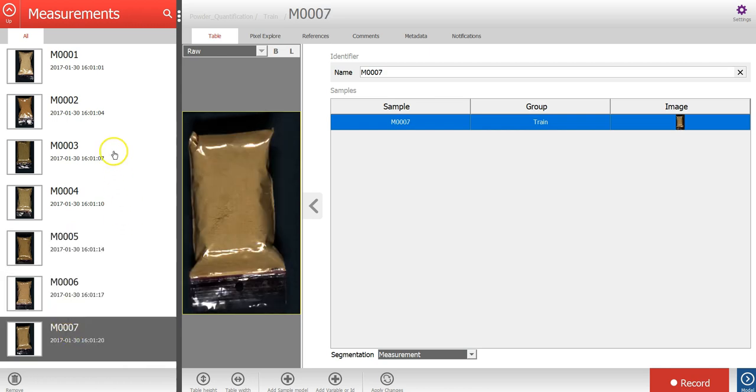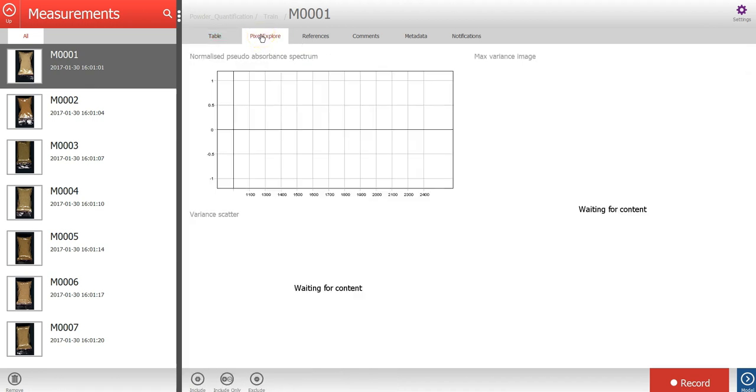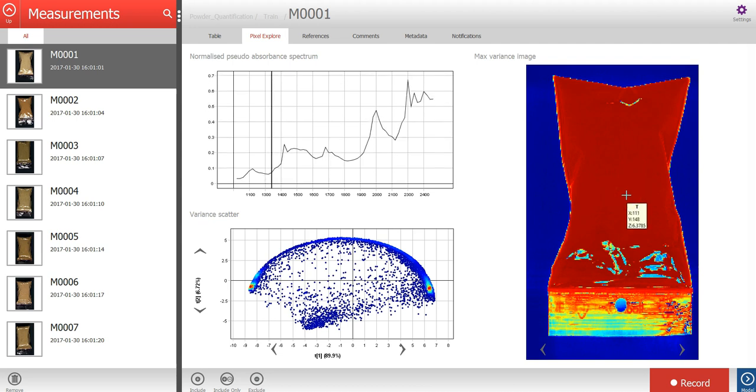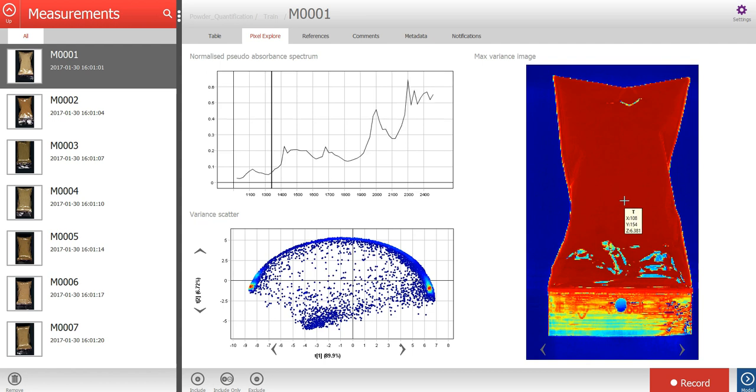Let's select the measurement and click on the pixel explorer tab. To do a quick analysis of the spectral variation in the image, a PCA model has been created based on all pixels in the image.